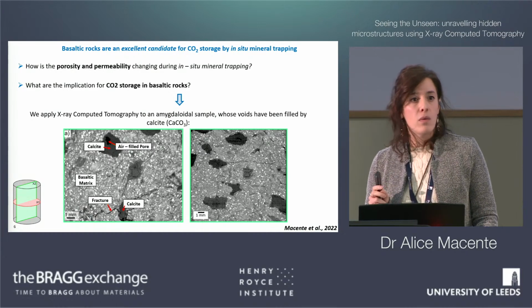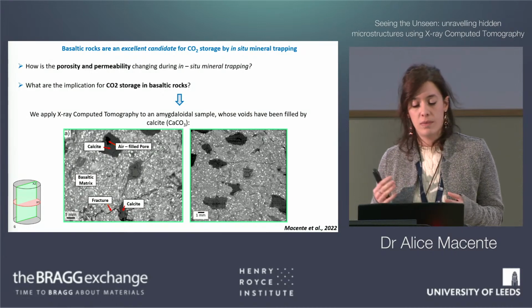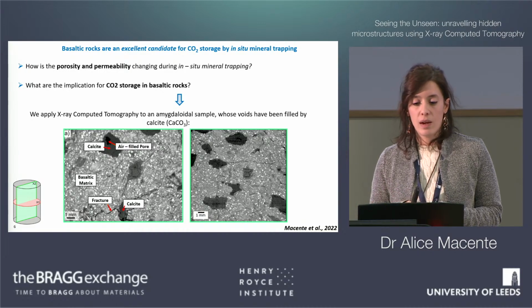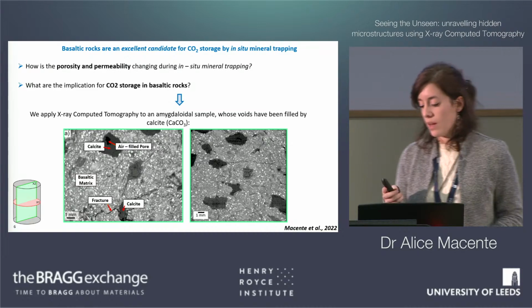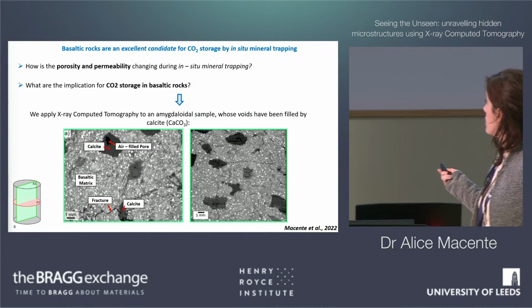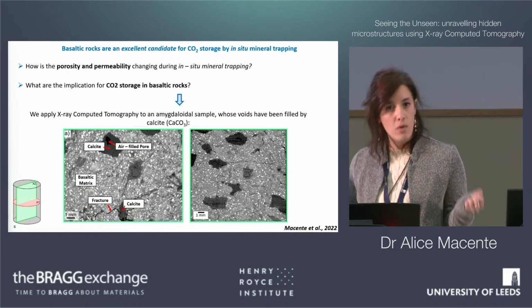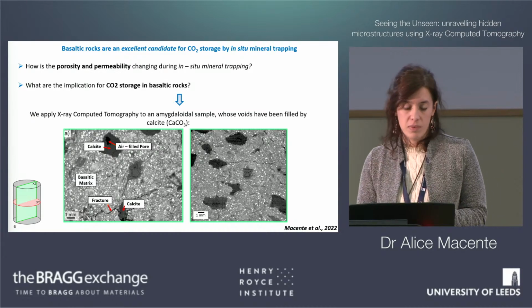So how can we quantify how the calcite modifies the porosity of the rock? We can employ an algorithm that is called digital backstripping. Essentially, we take all the calcite that is now filling the material and try to digitally remove it, to make in reverse calcite precipitation.